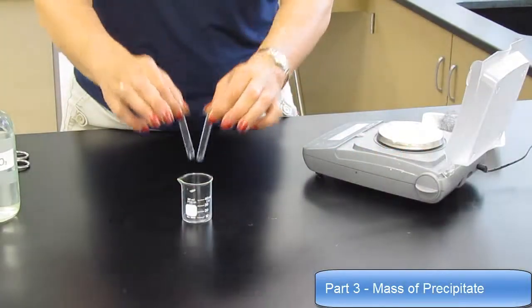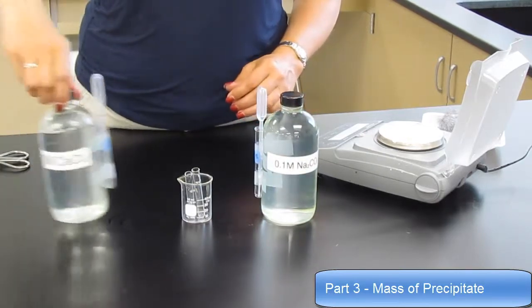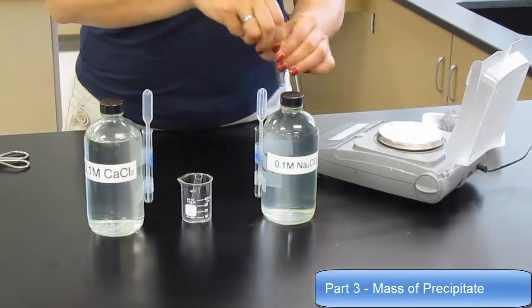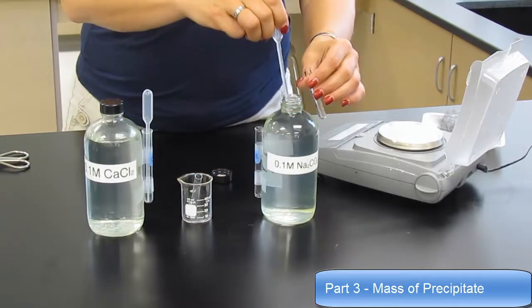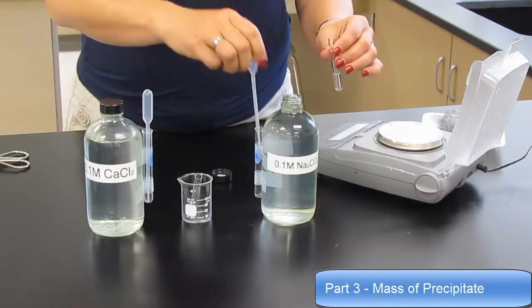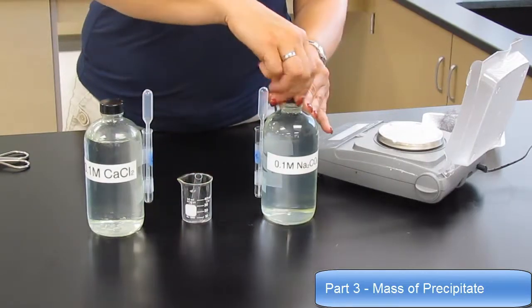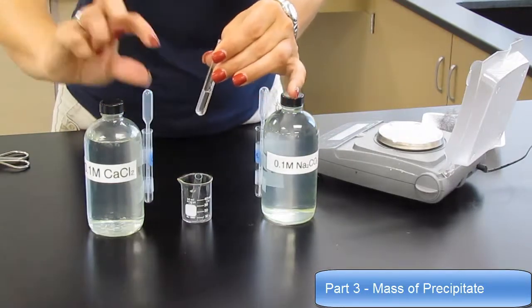Part 3, mass of precipitate. For this one, you're going to need a small beaker to hold some test tubes, 2 small test tubes, and 2 chemicals. 1 is calcium chloride and 1 is sodium carbonate. Fill approximately 1/3 of the volume of your test tube with one of the chemicals.